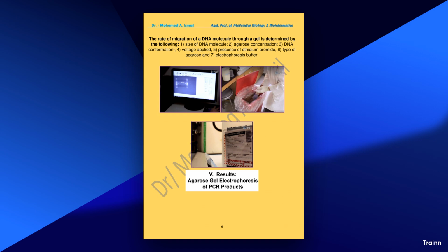Low specificity of primers: primers may have low specificity due to mismatches with the target sequence. Inappropriate PCR conditions: suboptimal annealing temperatures or extension times can promote nonspecific binding. Solutions. Optimize PCR conditions: adjust the annealing temperature and extension time. Redesign primers: use software to redesign primers that are more specific to the target sequence.